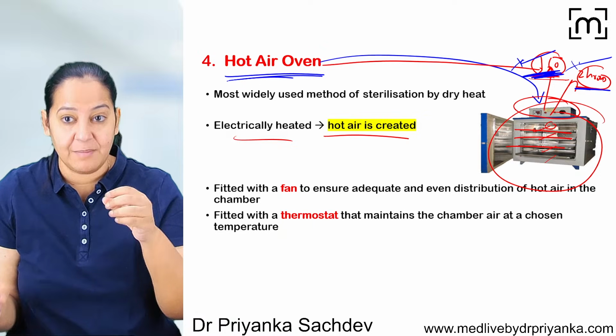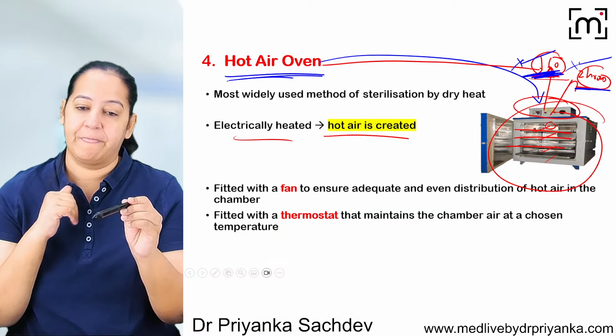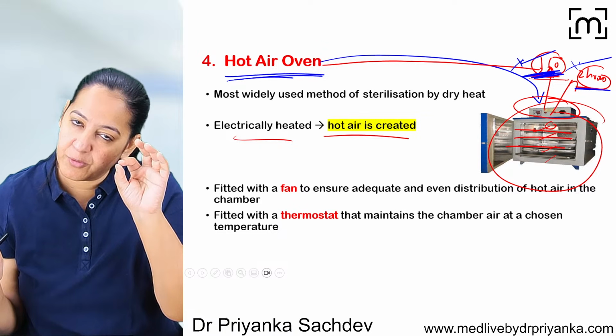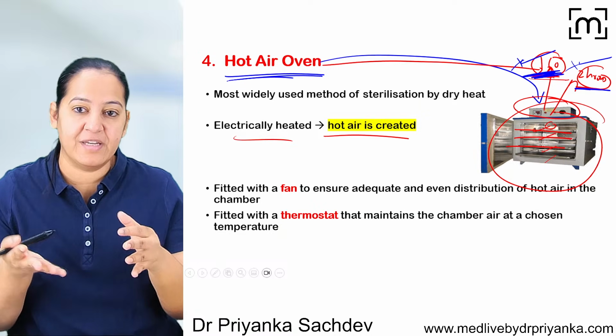After 2 hours, whenever there is a buzzer, I open the door. Before touching the article, I will take the packet out and open the packet. I will see whether the spores are dead or alive. If the spores are dead, the process is successful. And if the spores are alive, the process is unsuccessful. You have to repeat it. You have to fix it.